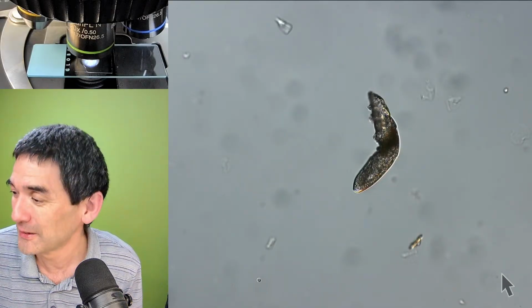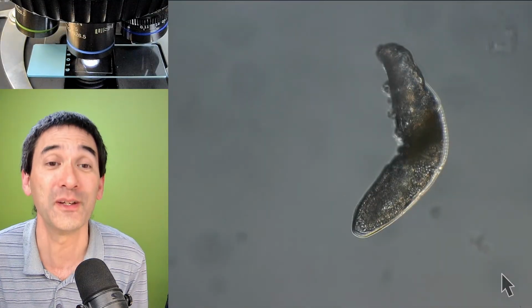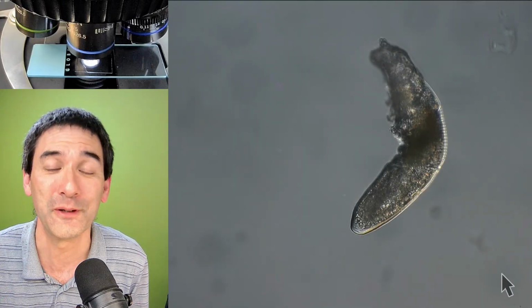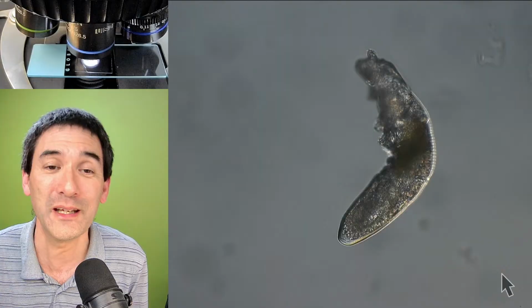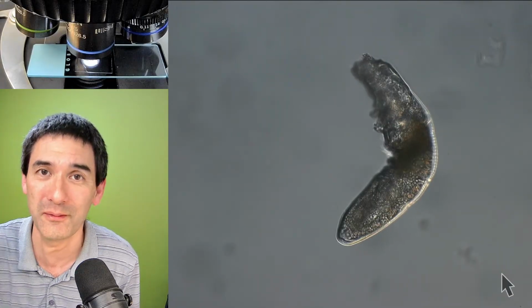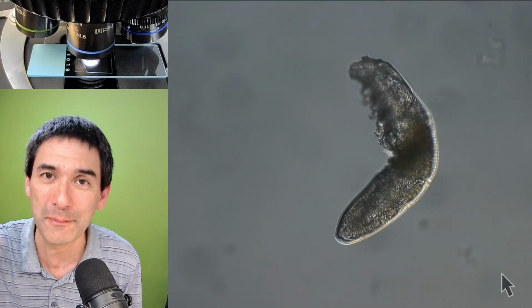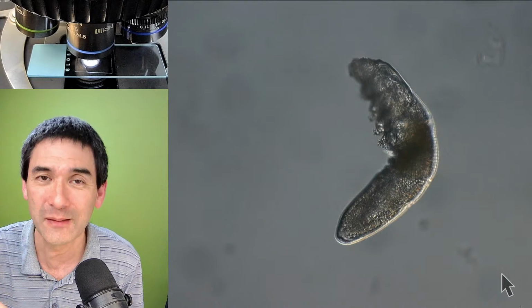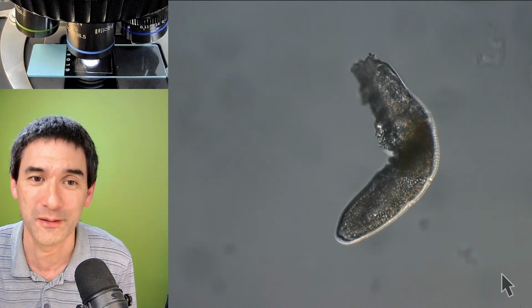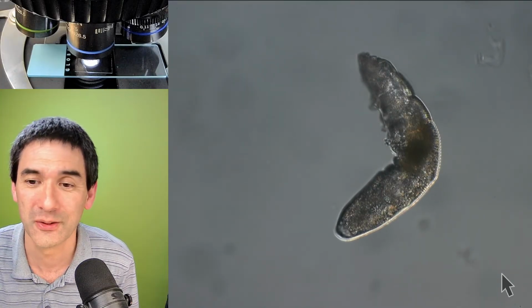So let's go up here again a little bit with the magnification. I'm really fascinated by those creatures here, right? By the way, in case you're wondering, in the trailer of these live streams, before the live stream starts, I show some video clips and pictures with some music. One of the clips is also one of these face mites, a fairly large one that I found.